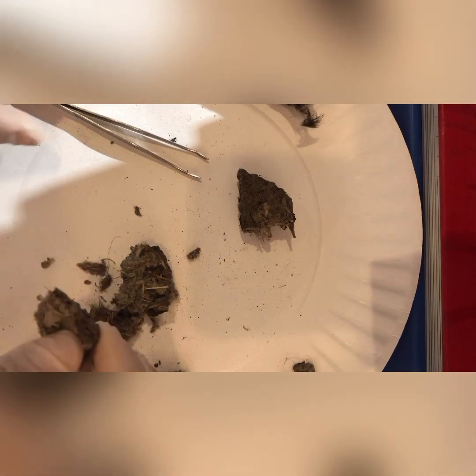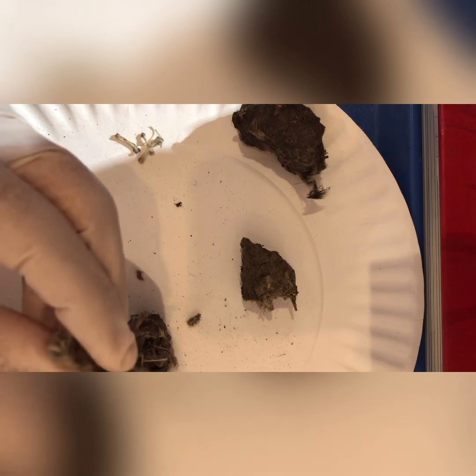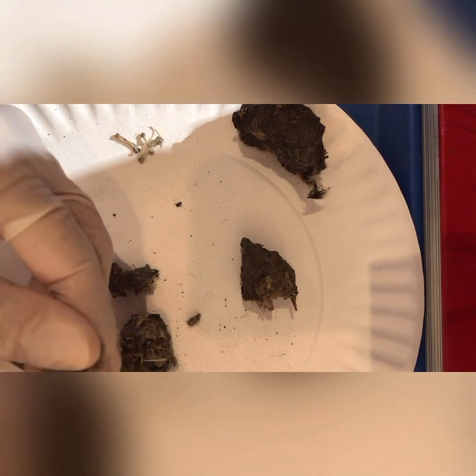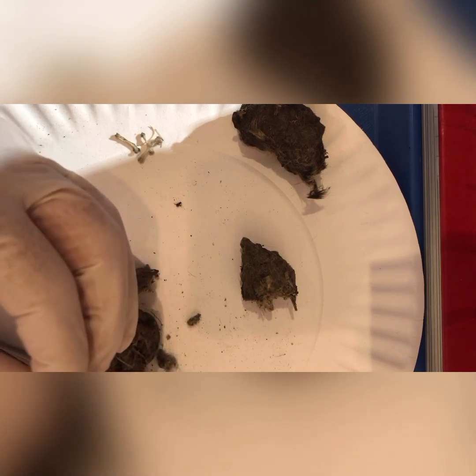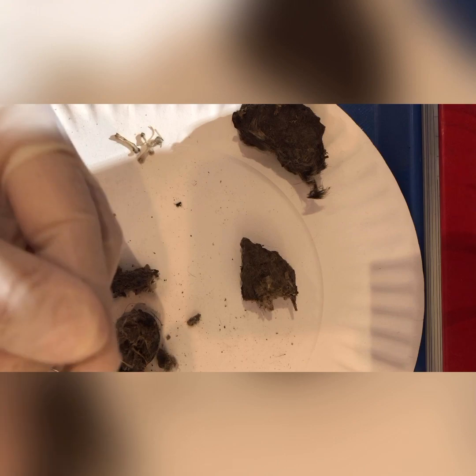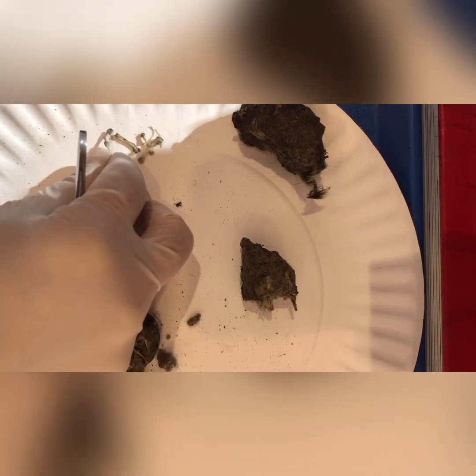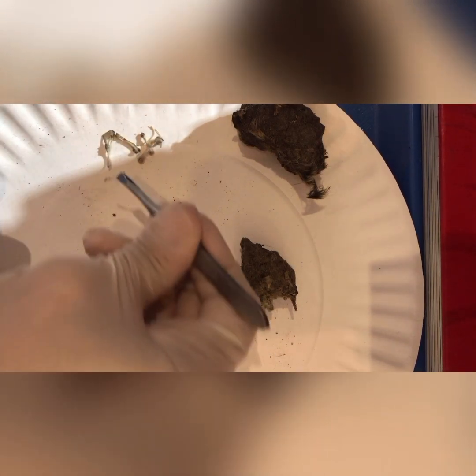So all the bones, I don't know if you can see on camera here, all the bones that I'm collecting, I'm moving off to the side, and I'm going to save that for later, and I'll show you what we're going to do with that later on. You guys see I'm being really, really careful. Another bone that I have found. This one's actually a really good one to help me identify the organism that I have.